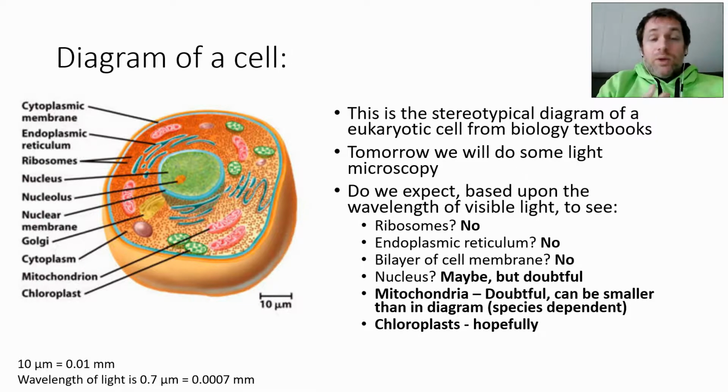So, we can stain the DNA to make it easier to see, which will make the DNA larger than the wavelength of light. But generally, we do not observe nuclei or DNA when we look through light microscopes.